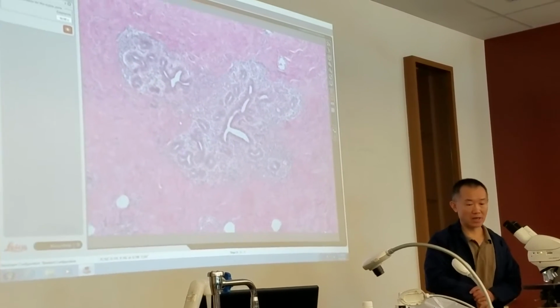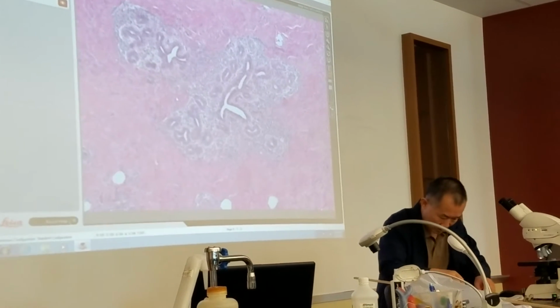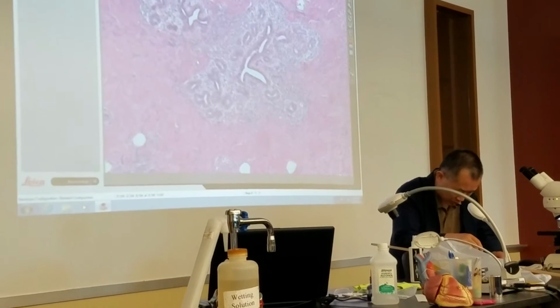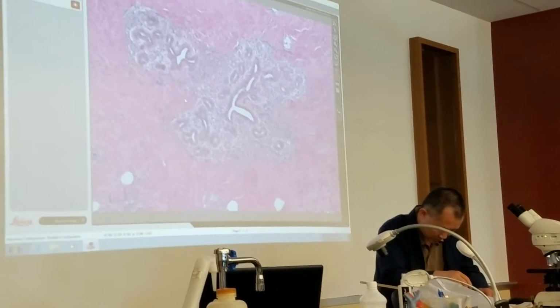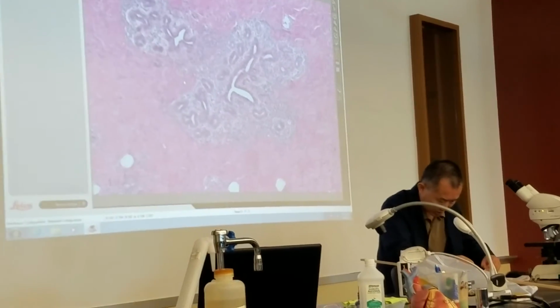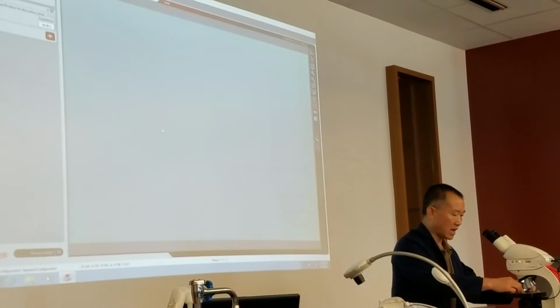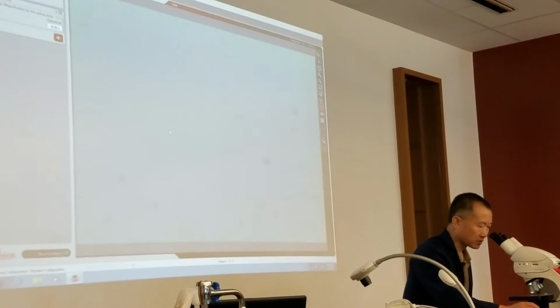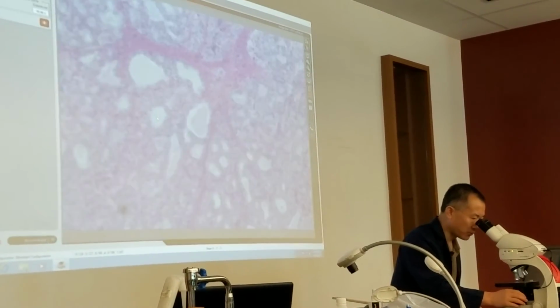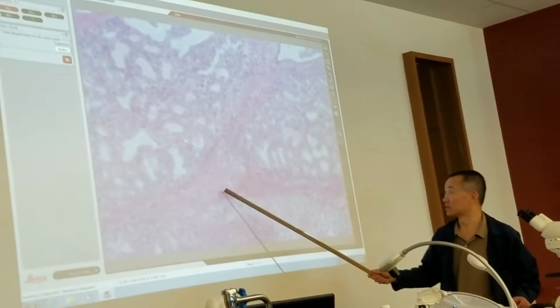Then someone has a baby, and now you see the changes. So this case is somebody who's feeding a baby, lactating, active, a big difference. See, I move around, everywhere is lobule. You still see the interlobular space, but it's like this.